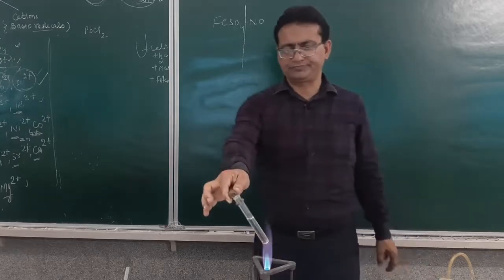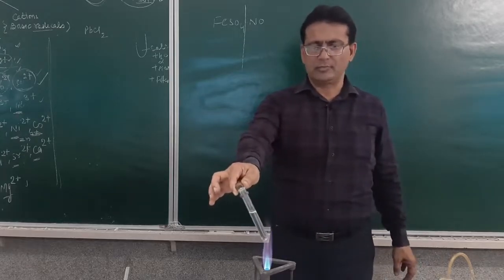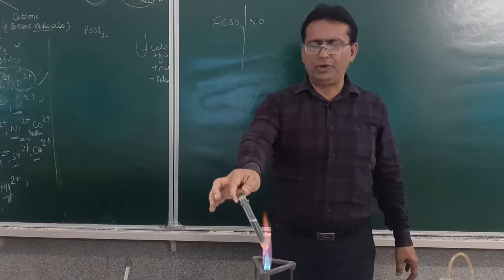Heat it up. Is it getting clear? You have to heat the solution.